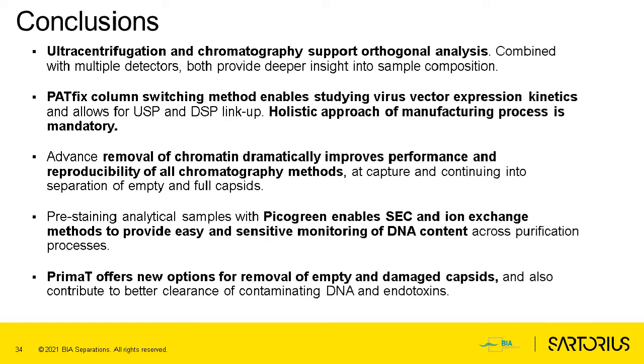So to conclude, very much again and again kind of calling for orthogonal methods. We need more methods. We definitely need still more analytics to better understand our gene therapy products. Ultracentrifugation and chromatography are nice orthogonal methods, and by using special detector setup, we can get more data, more visibility of things.